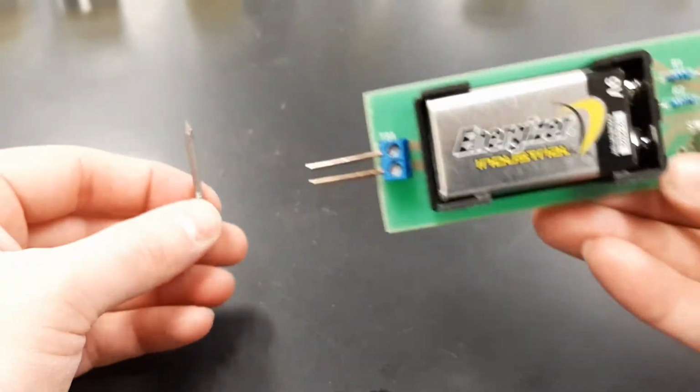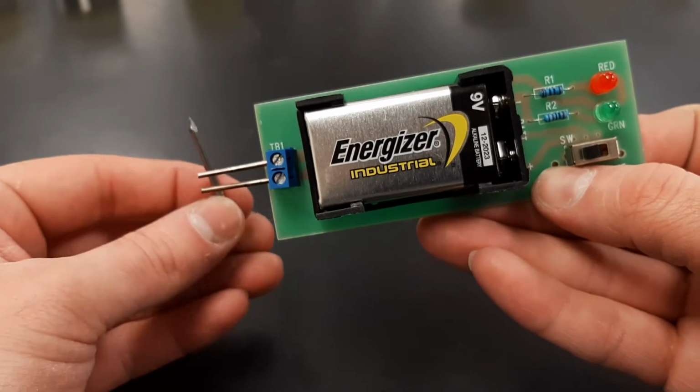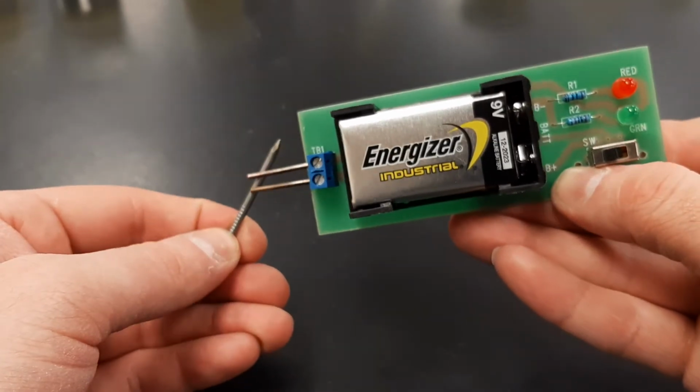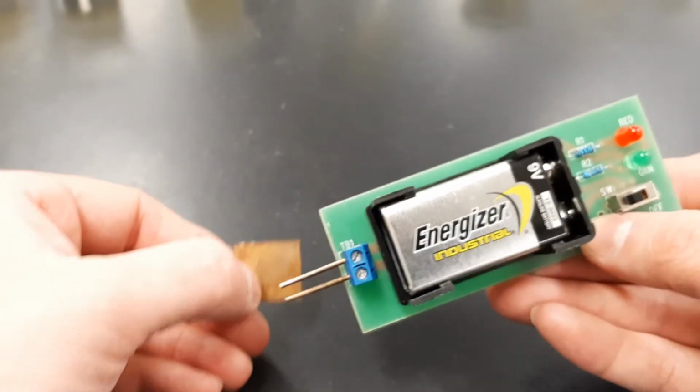Then I will be looking at an iron nail, which is made of entirely pure iron, which has a symbol of Fe. Then I will be looking at copper. This is pure copper, which has an atomic symbol of Cu.